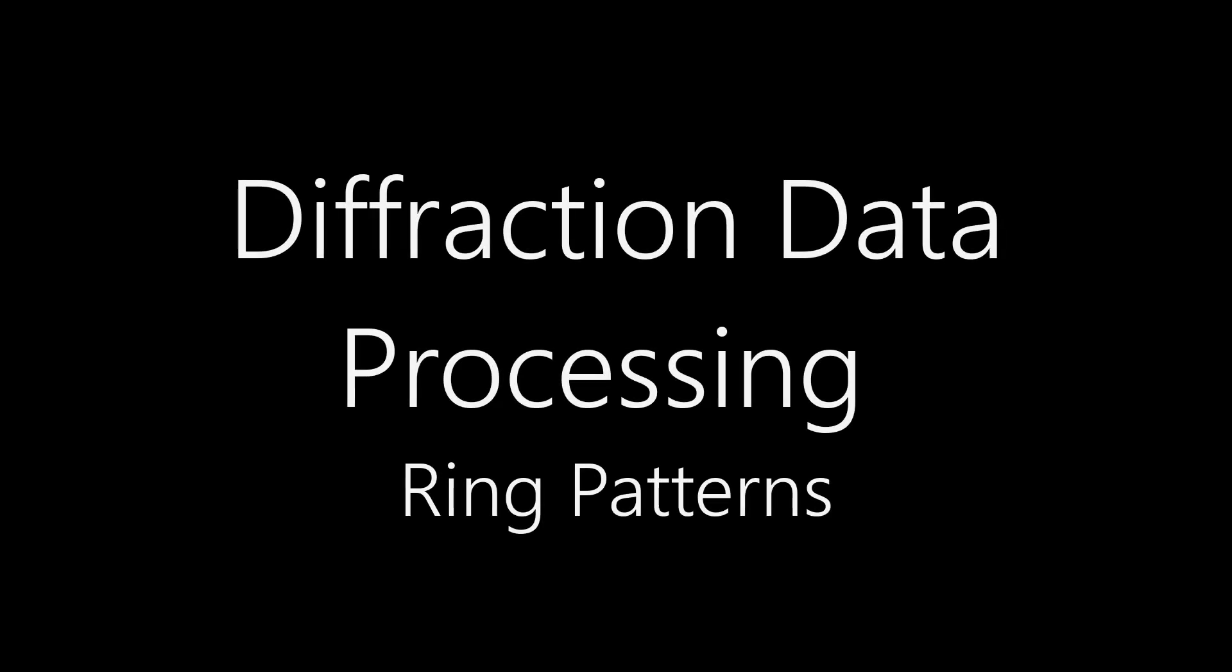In this video I'll be discussing how we process data from electron diffraction ring patterns that we obtain on a TEM.